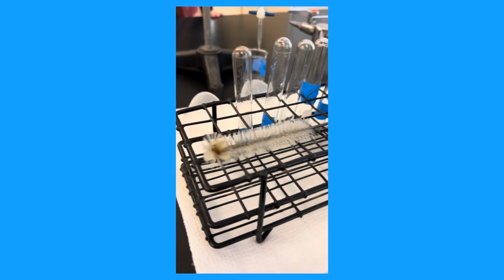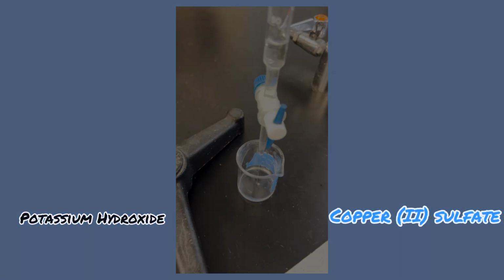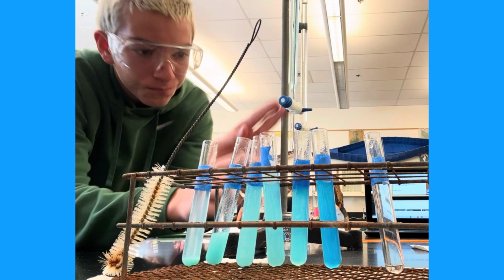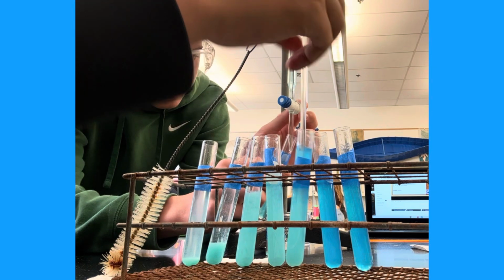Before beginning, we thoroughly cleaned our equipment with distilled water to ensure that our results were not skewed by existing compounds. Both reactants were transparent, but the copper(II) sulfate was blue in color, while the potassium hydroxide was colorless. Both were odorless. Using 2 burettes, we carefully dispensed 5 milliliters of copper(II) sulfate into 8 test tubes. Then we dispensed 1 milliliter of potassium hydroxide into test tube number 1, 2 milliliters into test tube number 2, and so on.